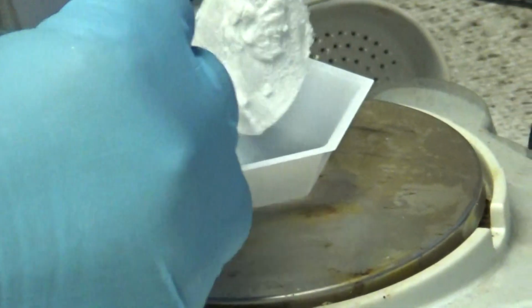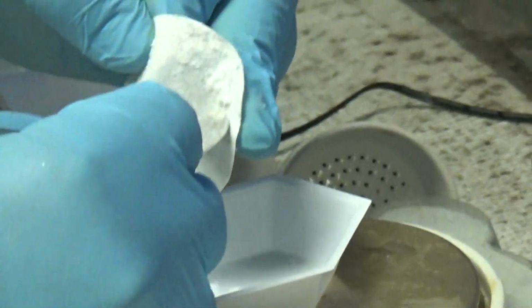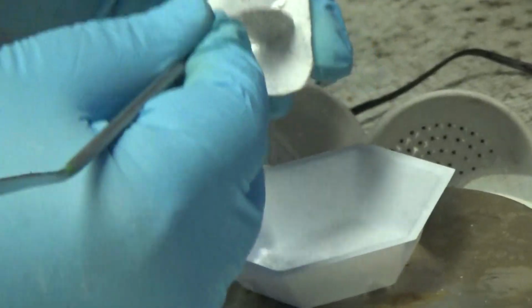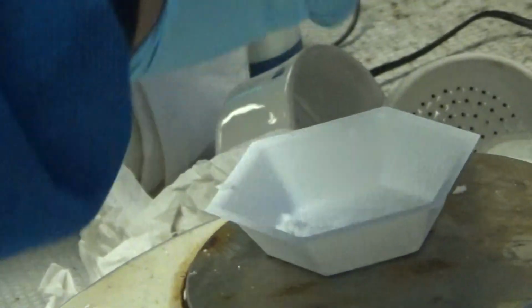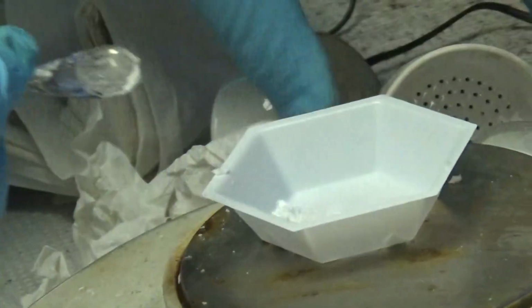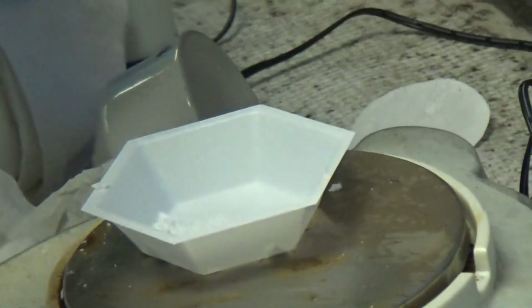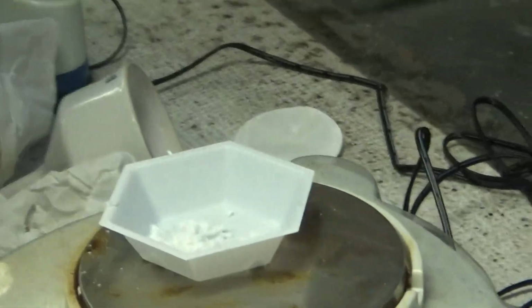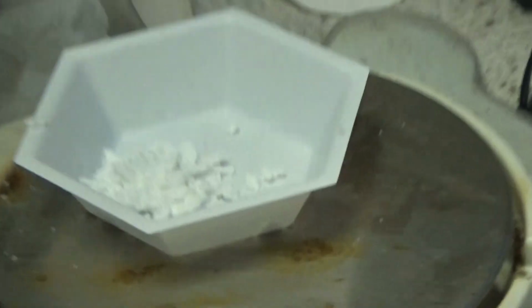Scraping it off there. It's cool. They're learning how to do some basic chemical reactions and synthesis. Organic 2 Lab is all about that. Yeah. But this is a good exposure to making new molecules, which is exactly what we did. Yeah. And isolating and purifying and everything like that.